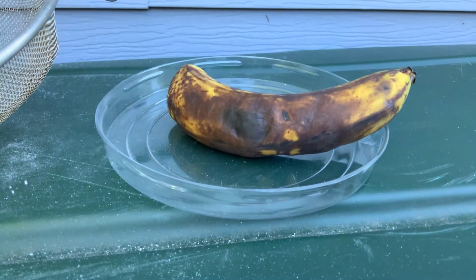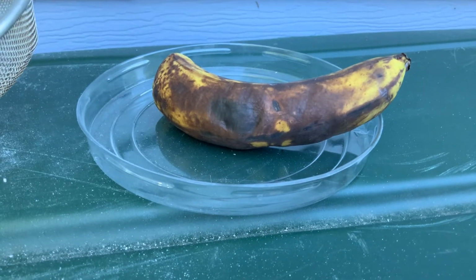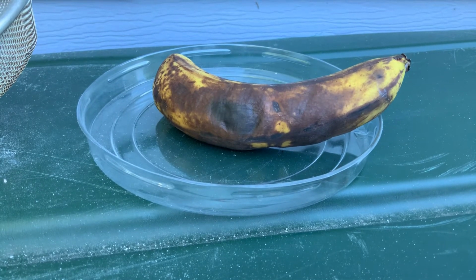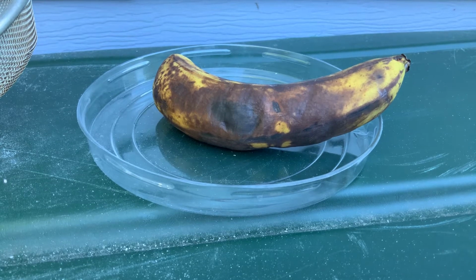Hey everyone! So this does not, well, it does. It looks like a banana on a lid to a pretzel box. Yeah, well, I guess that's what it is, but that's not what it will be at the end of this video. So today we will be making our own homemade fly media.